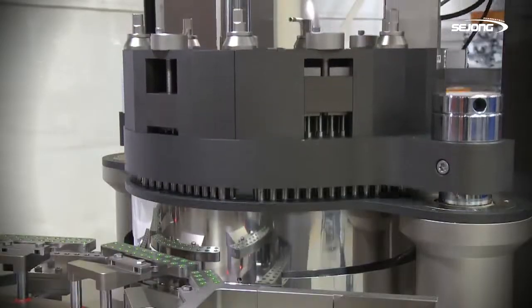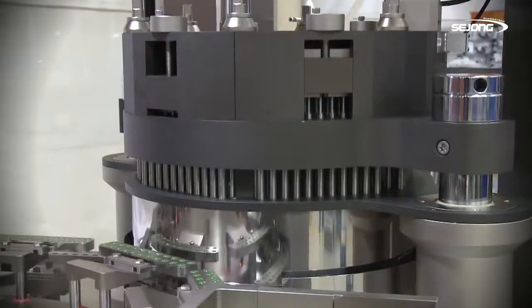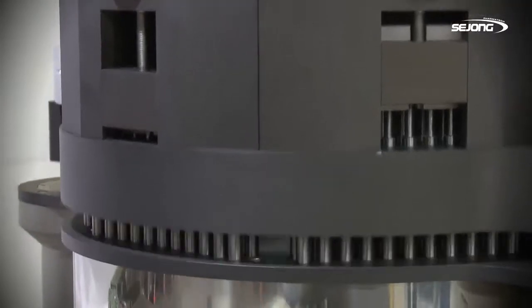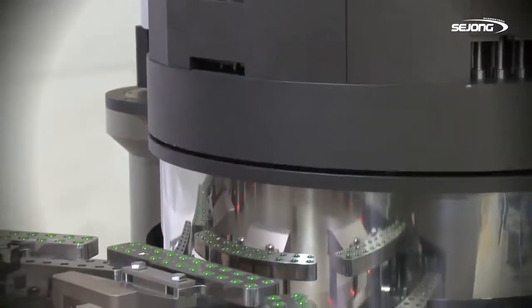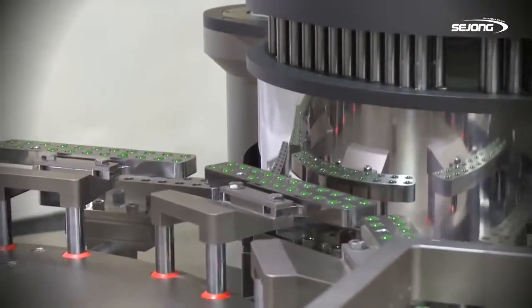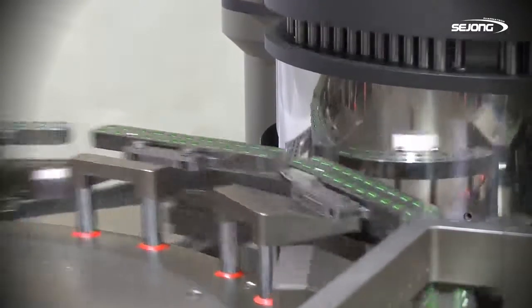All of Sejong Pharmatec's Automatic Capsule Filling Machine lines compress the powder after going through five compression stages before inserting it into the capsule, and pellets and tablets can be filled by the optional device.